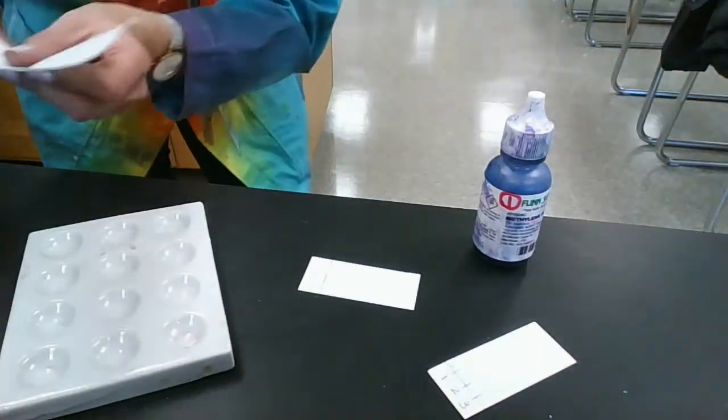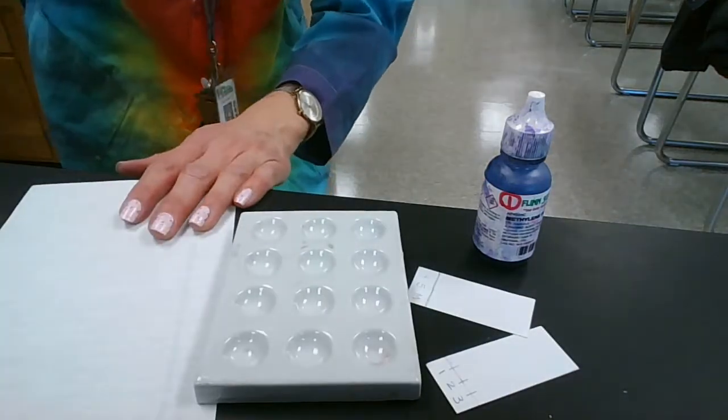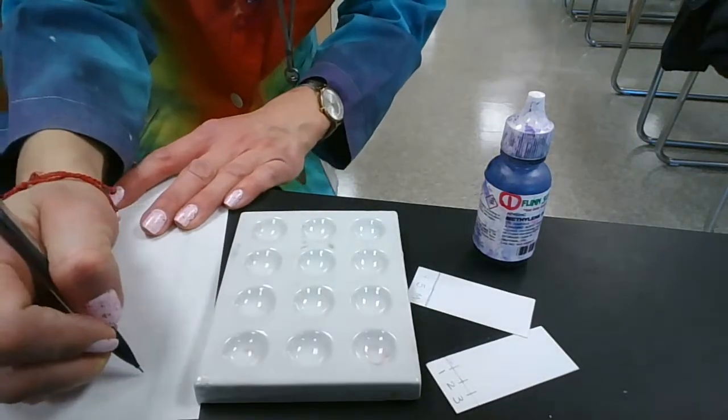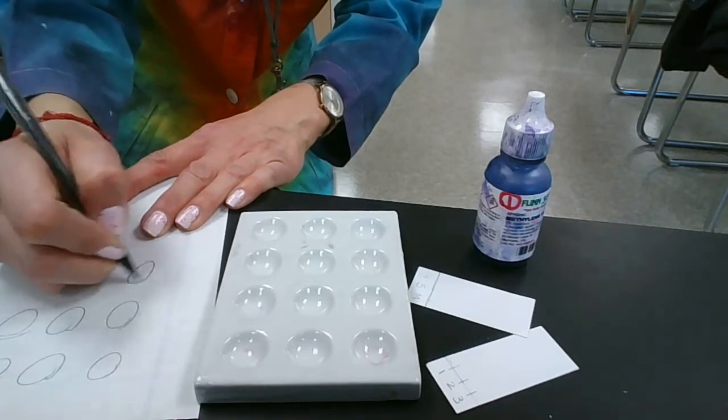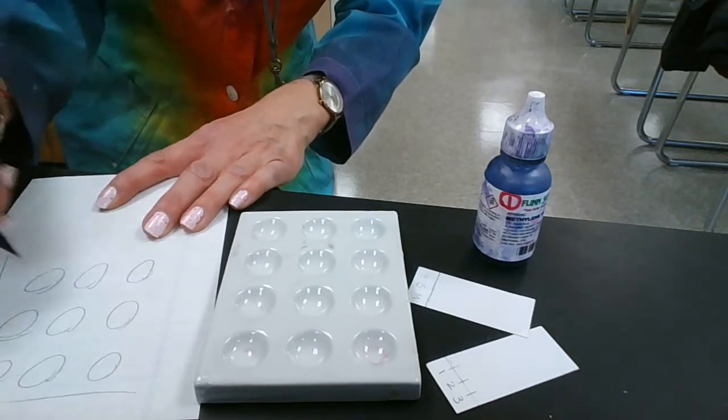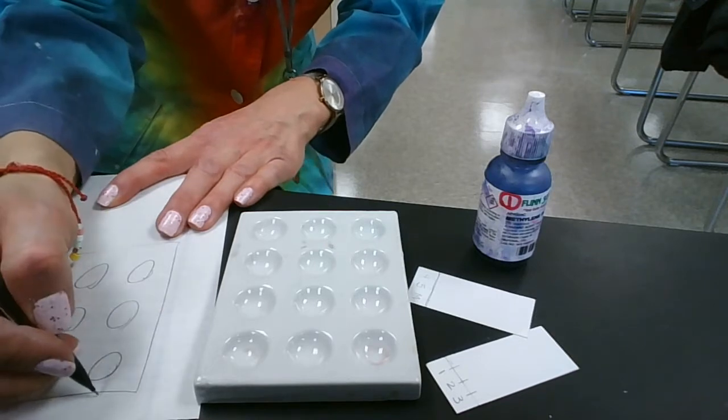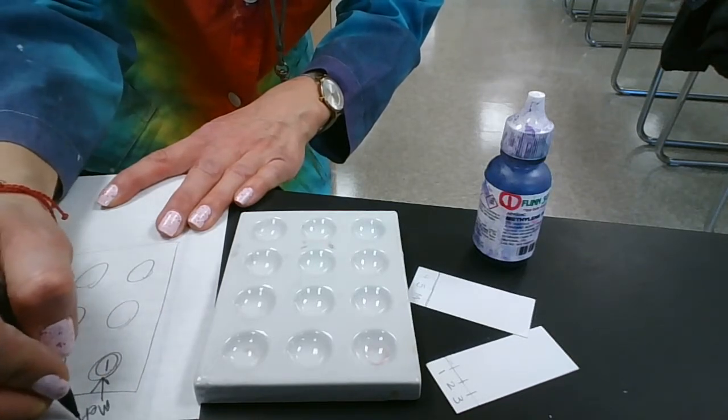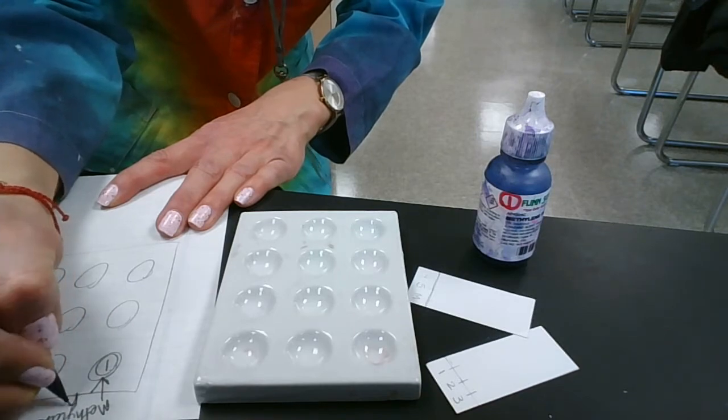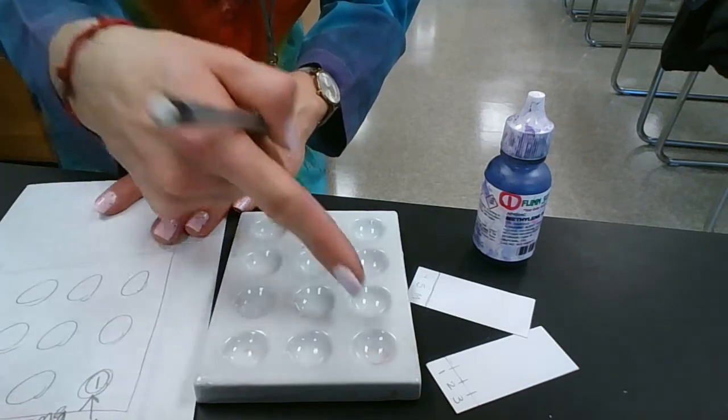Now when you get a plate, get some paper and keep track of what dye you're using. So if this is my plate, I want to keep track of where I put methylene blue. I'm going to have to say, okay, this is dye number one and this is methylene blue, so I know what I've got on my plate.